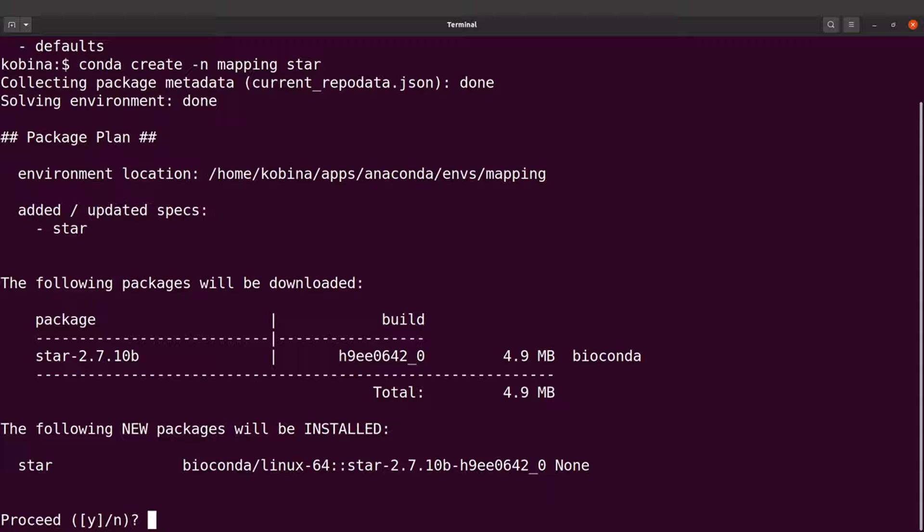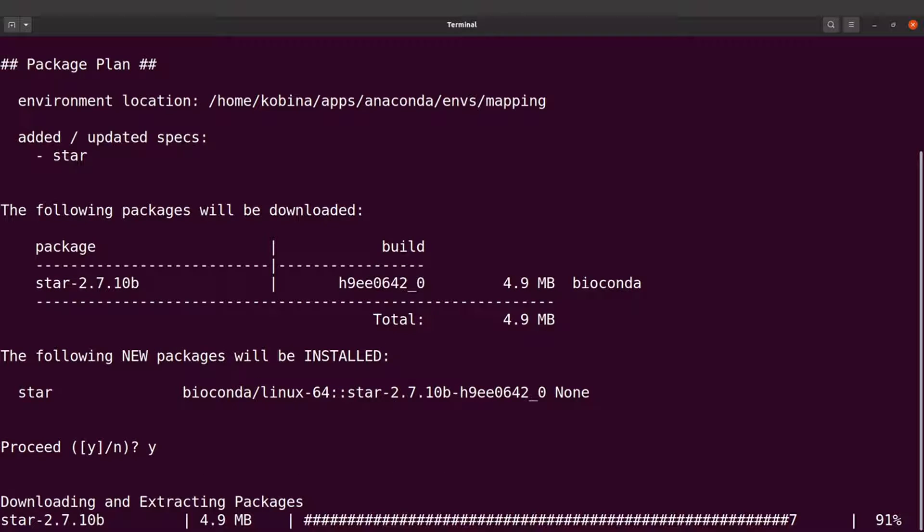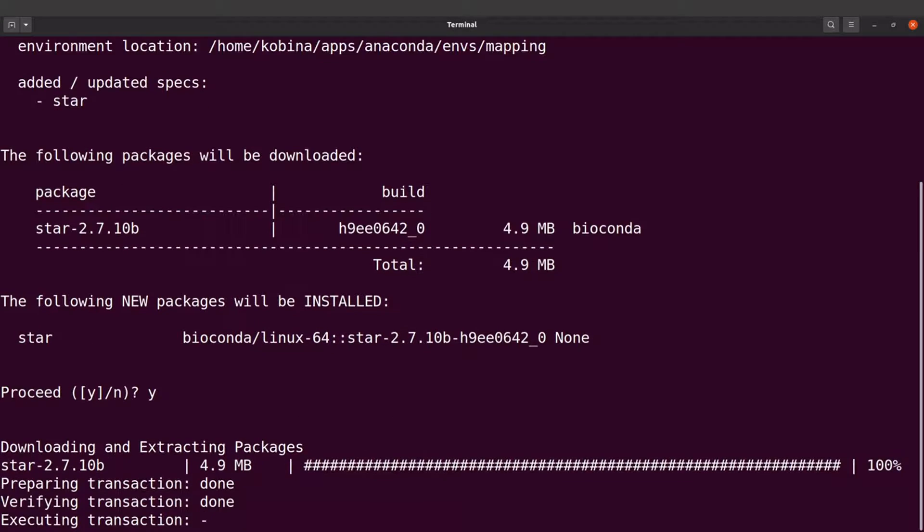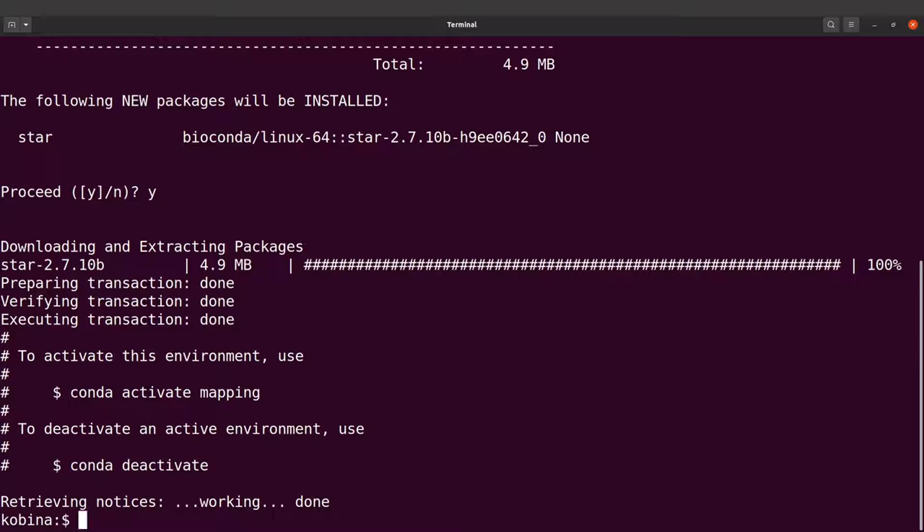Let's type Y to confirm. So conda will download all the necessary packages and then set them up for us. So STAR has been installed successfully. Now we are going to test STAR.